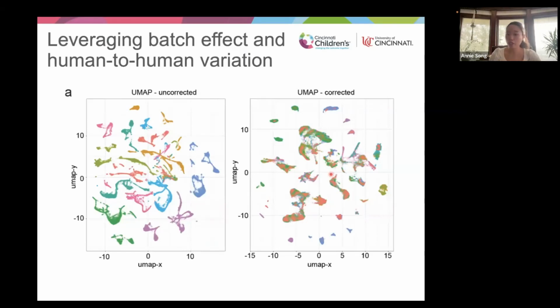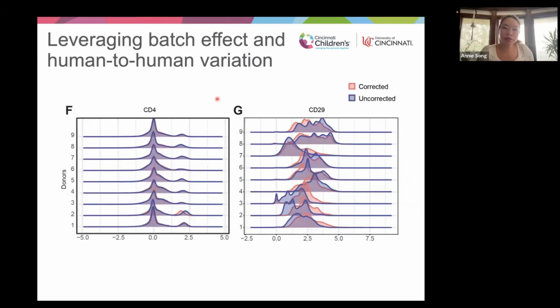And this is very good, right? Because it proves that not only did we have batch effect, but the batch effect can be corrected for using this tool. After we use the tool, we can see the alignment of the shared cell types, indicating that the donors we sampled indeed fit what we expected, which is to have most of the cell populations present. Now, when we talk about batch effect correction, and in this case it is antibody level data, we oftentimes have to think about whether the correction made sense.